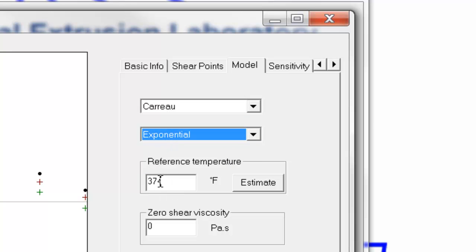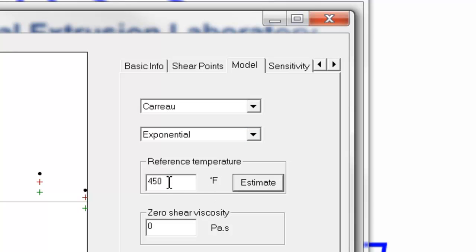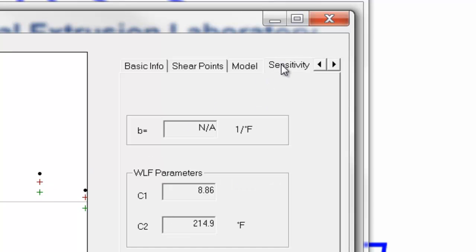For the reference temperature, we want one of the center reference temperatures in our data. So if we can't remember that that was 450, we simply click estimate, and it will determine the value from the data provided. The next tab is sensitivity, and it shows that it's not applicable, because we have data at three different temperatures and so we don't need to enter this parameter — the software will calculate what this value is based on the data.